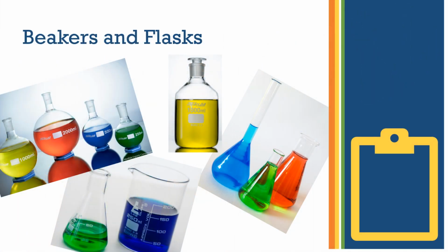First up, we have beakers and flasks, two of the most commonly used pieces of glassware. Beakers are cylindrical containers with a flat bottom used for mixing, stirring, and heating chemicals. They come in various sizes and often have measurement markings. While not very precise, they are great for general use.